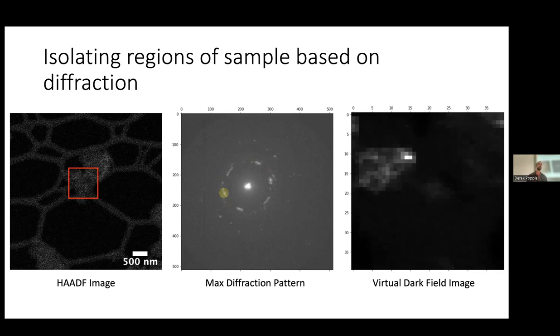And so you can imagine using some of the code, you might be able to carry this out for all of the range of angles from plus or minus 90 degrees and create a similar colorimetric map to what I had showed earlier as an example, and start to understand how these crystals are oriented and gain some insight into how these materials are actually crystallizing.